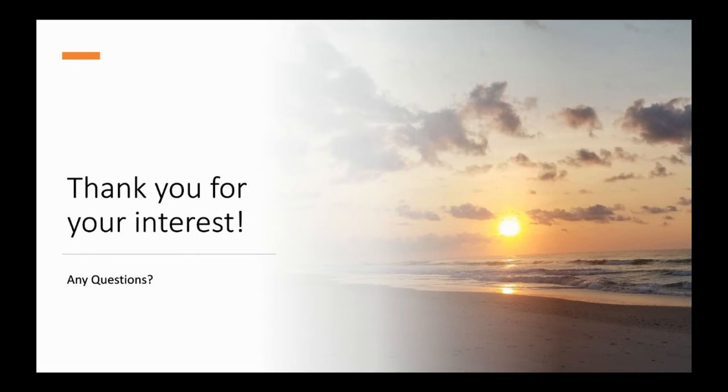Thanks, Carlos. All right. Well, if no one has anything else, let me encourage you guys: if you think of anything, like Mark was saying, look at fermentation, or even if you want to look at constituents of some plant that's in the greenhouse or anything like that, or if you're doing, I know we're not supposed to use human blood, or if something like that comes up, we can always try and run them on the mass spec and think of some different projects to be used on the mass spec. So please let me know if you have any ideas, and I'll be around.